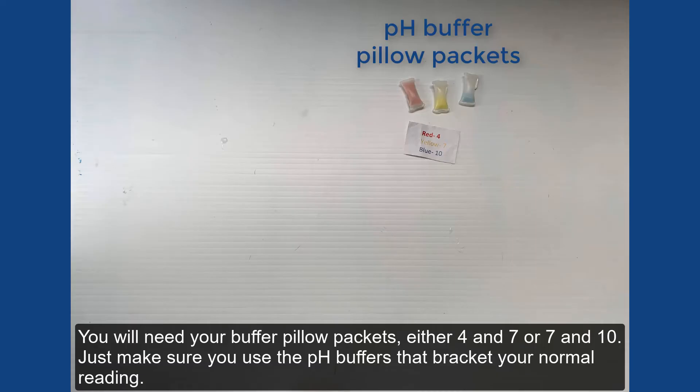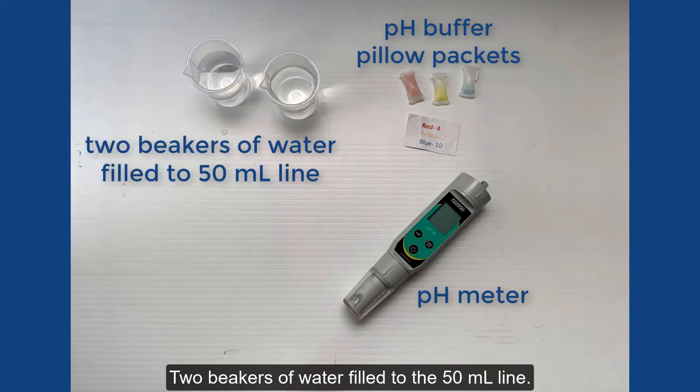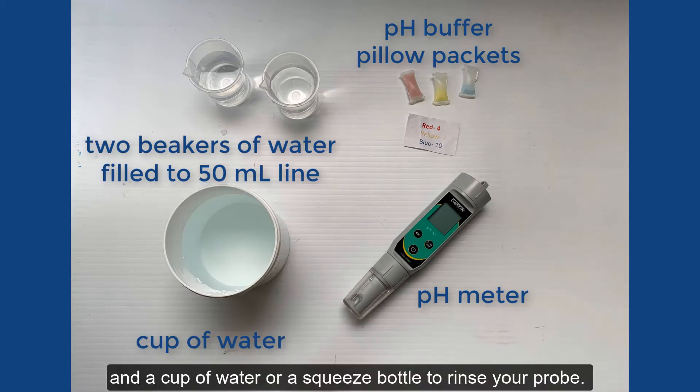You will need your buffer pillow packets, either 4 and 7 or 7 and 10. Just make sure you use the pH buffers that bracket your normal reading. You'll also need your pH meter — try to soak your meter in buffer 4 solution for about 30 minutes prior to calibration. Have two beakers of water filled to the 50 ml line, and a cup of water or a squeeze bottle to rinse your probe.